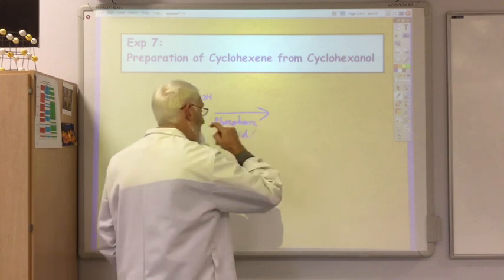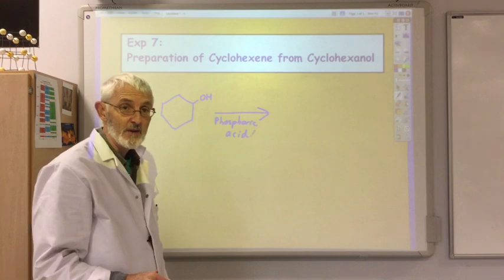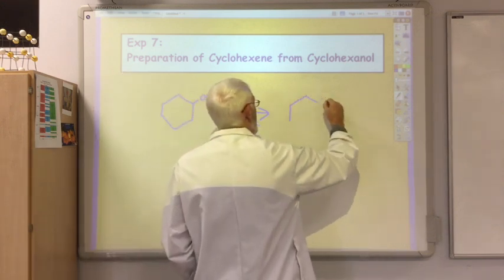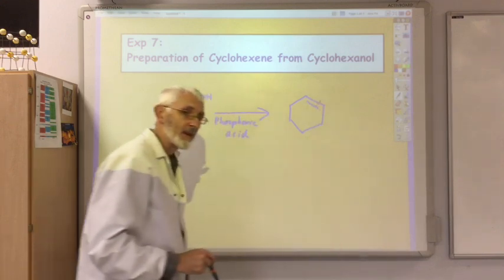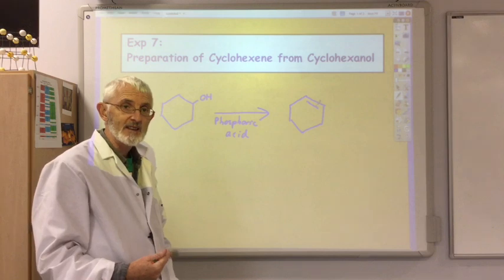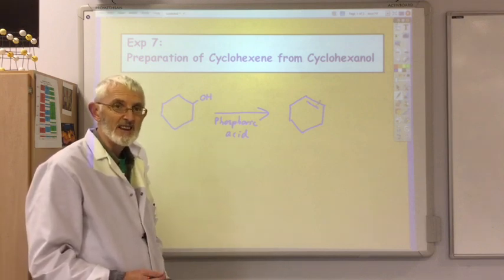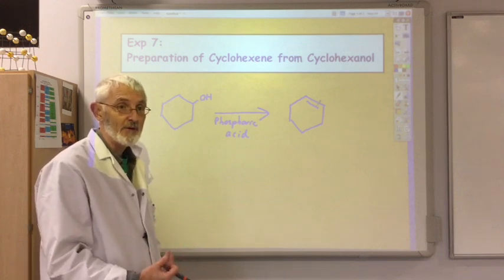Basically you just add phosphoric acid to your cyclohexanol, heat it up for 15 minutes and you should get your product cyclohexene. However, that's not the end of the experiment. As in most organic synthesis, it's not the making of the product that is the difficult part — it's then extracting the product from the reaction vessel and purifying it.